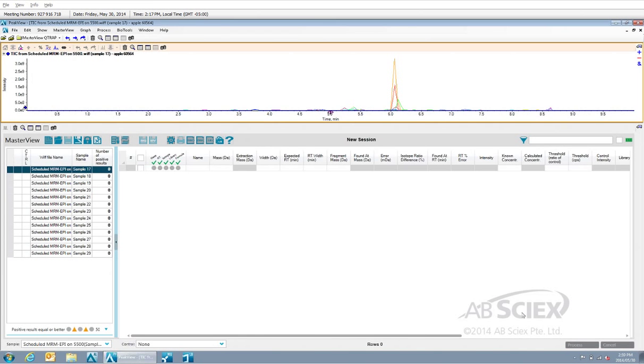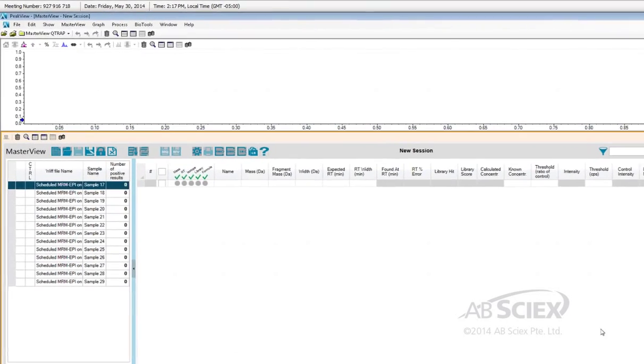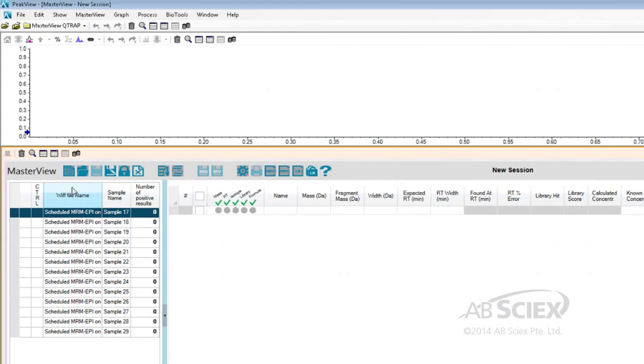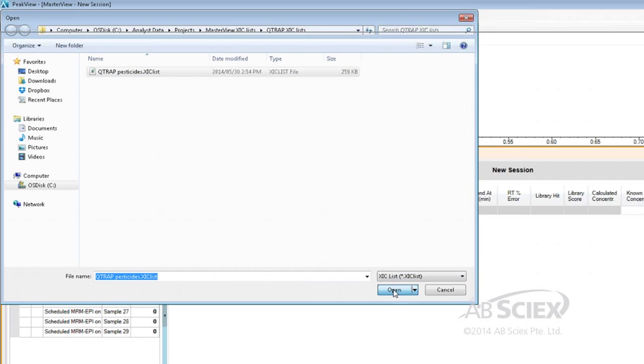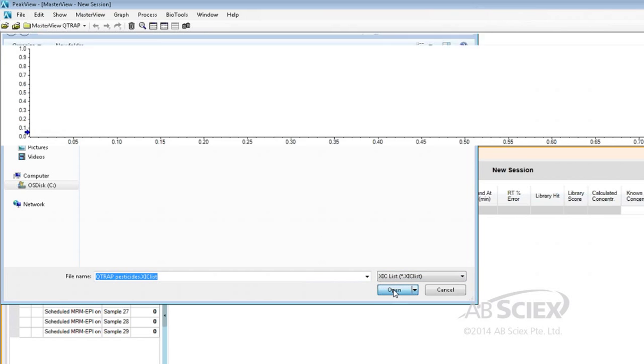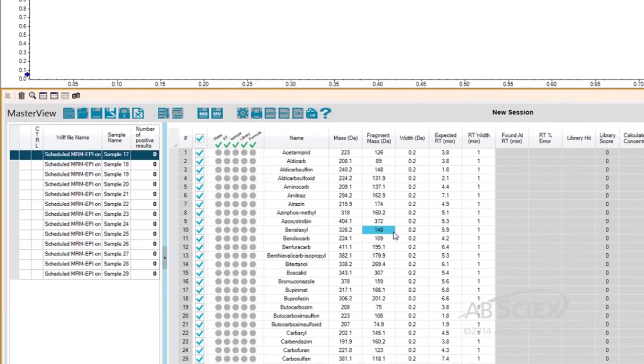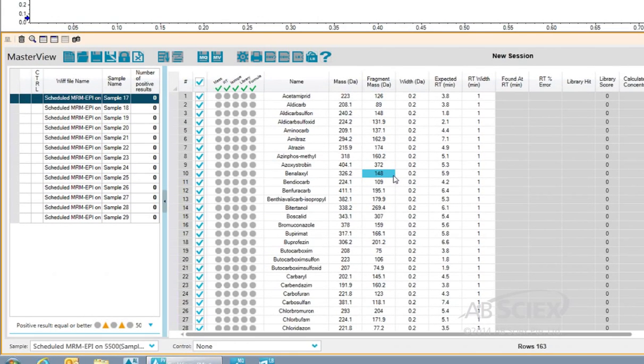Next, we open our compound list that we want to screen our samples against. In this case, we are opening our pesticide screening list. This pesticide list contains the names of all the pesticides in our MRM method, including the Q1 and Q3 masses, or the MRM transition information, and the expected retention time.